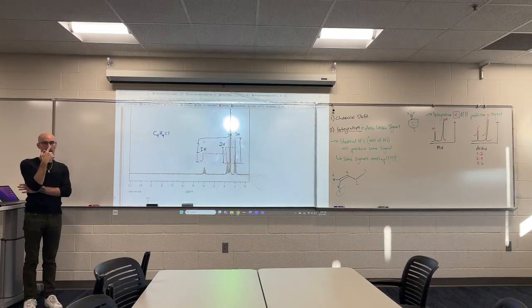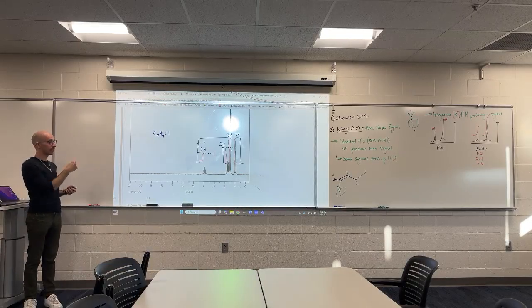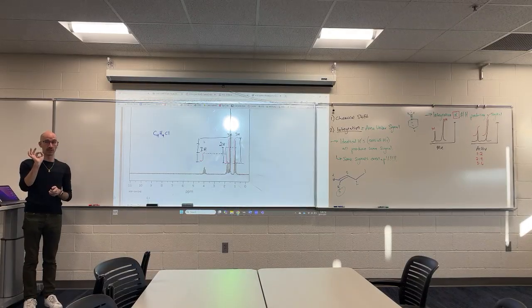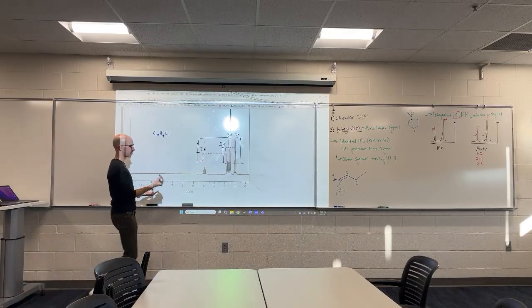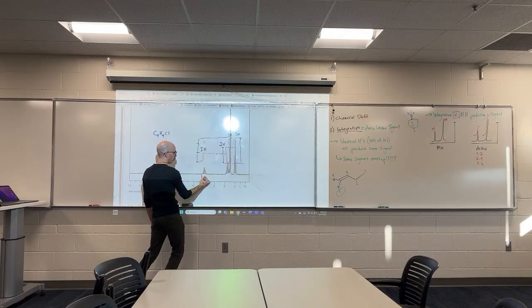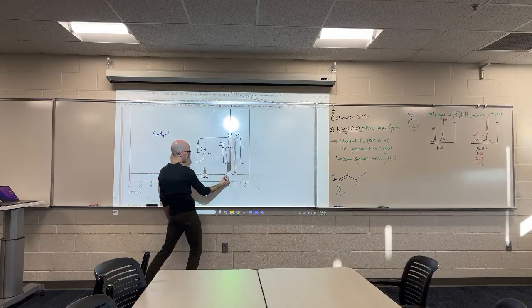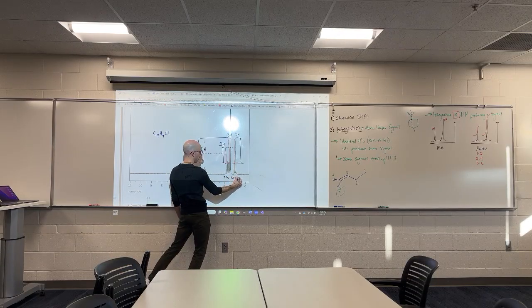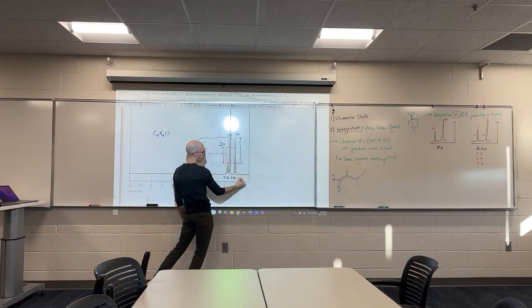But I mean it when I say computers will show you these lines, and they will give you calculated values that you can shift as you want to be these numbers. In fact, when you do an experimental one, the computer is doing real math. So you get something that's more like 1.001 to 2.16 to 2.97 to 3.10.